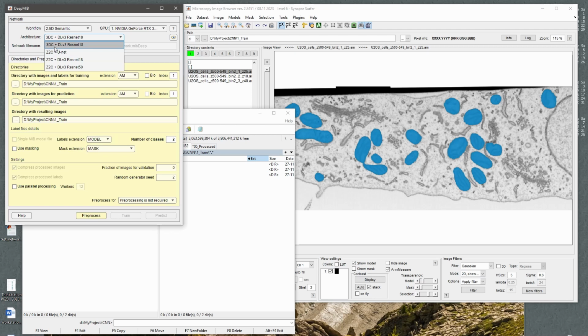The first option here is doing a slightly different thing. It actually starts with applying 3D convolutional filters. So instead of arranging things into the color channel, it really does 3D convolutions on the small subvolumes. I think it's here basically for some tests, because I personally am not very satisfied with the performance of this. It's quite slow. And in many applications, it's way easier to use these guys here, and that's what we will use today.